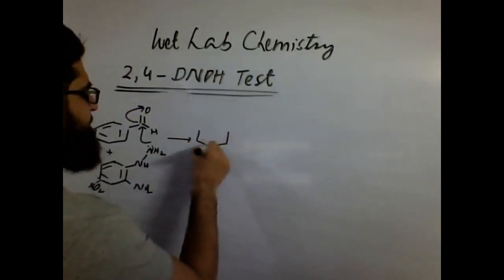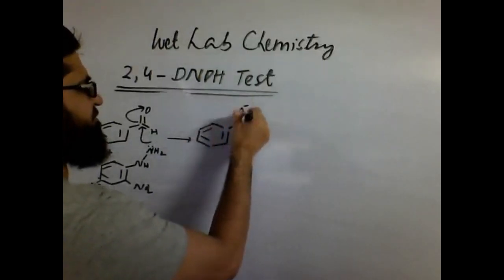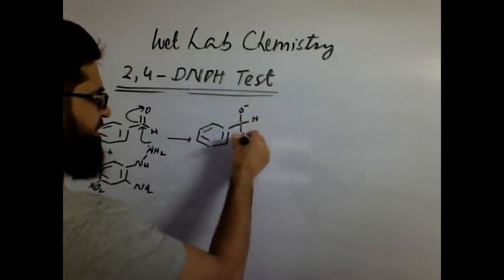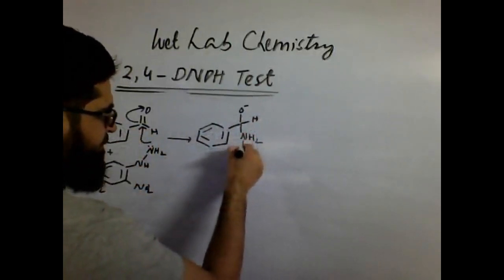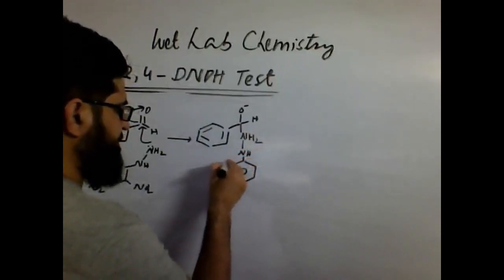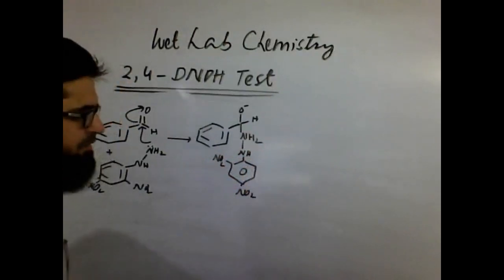So what do we expect actually? This moves in the form of O negative. We usually don't write H, or we can write the other way. We have nitrogens having 2 protons there. We have another nitrogen, and then we have the rest of the molecule as this one.